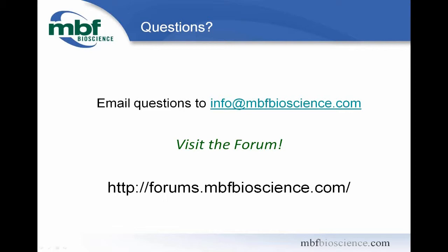These series of image stacks can be opened by either directly opening the DAT file, in which case Stereo Investigator will automatically load the Z stacks at their correct position relative to the contour, or you can open the data file using our Optical Fractionator workflow. This topic of how to work with these files in one of these other workflows is a webinar all in and of itself.